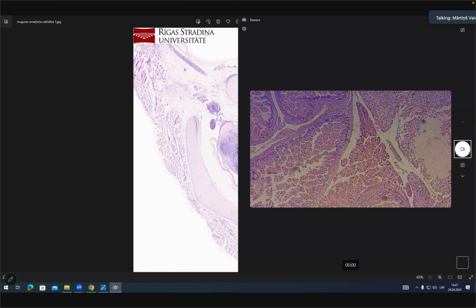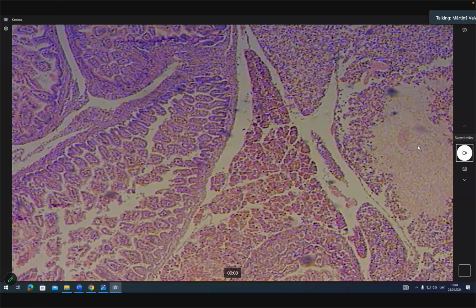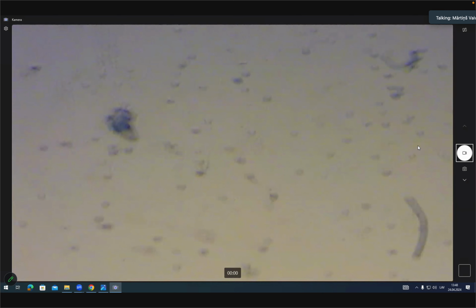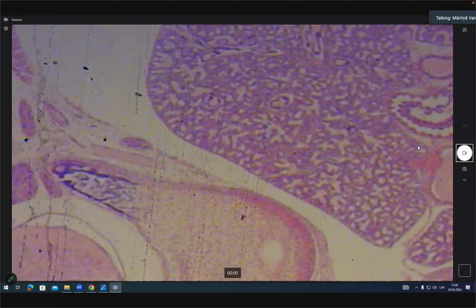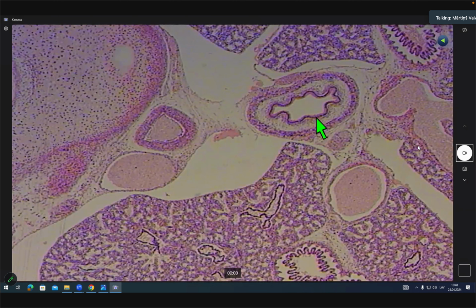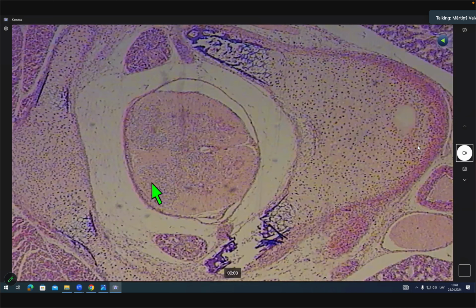So vertebral column is asked typically in slides where you might see other structures as well. Well, for example, let's take the rat embryo. Rat embryo cross-section. And if you check here, I won't go through all the structures here on the slide. We already checked the picture. Of course, we see the lungs, esophagus, but let's check here.